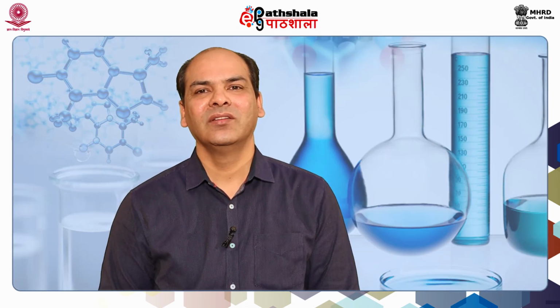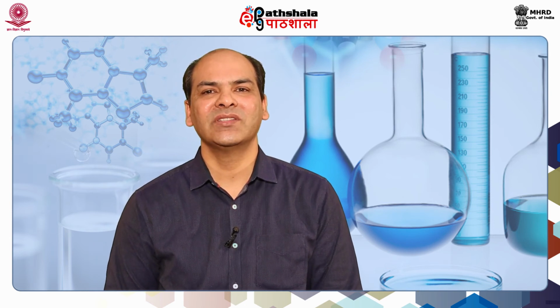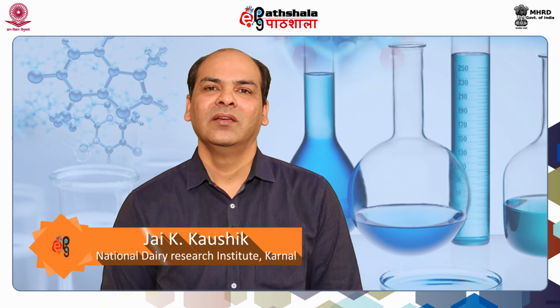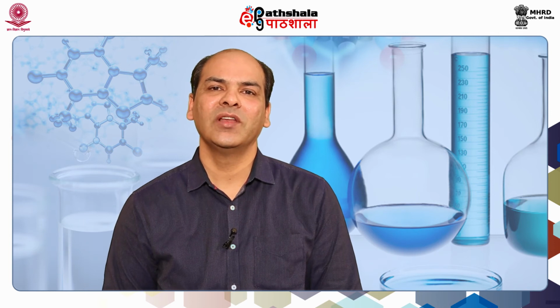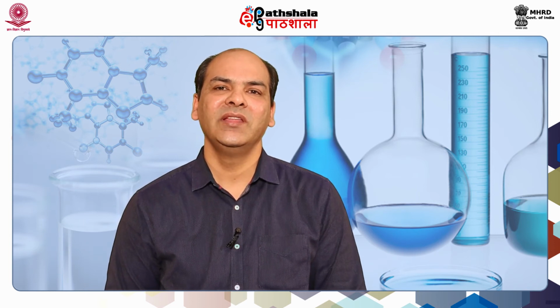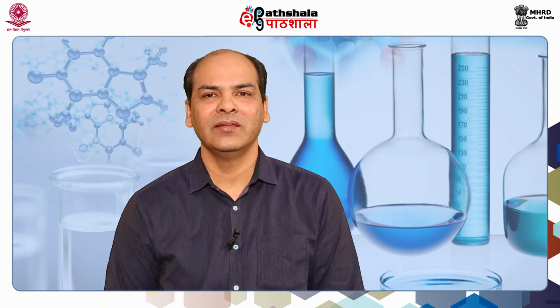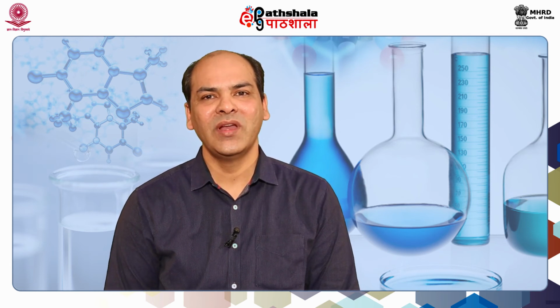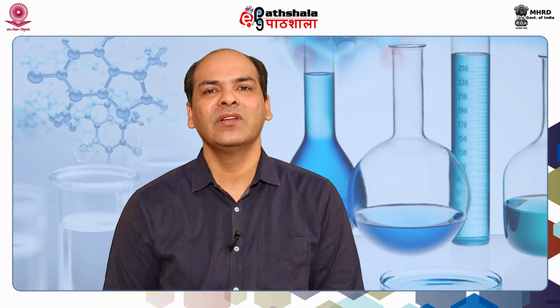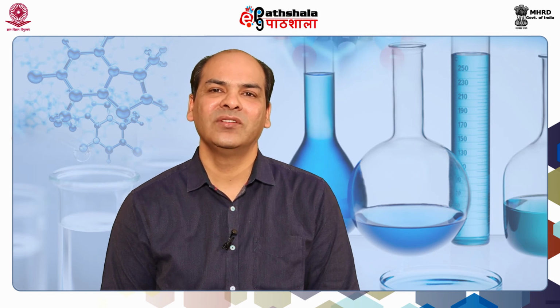In the previous slides, I introduced you to the concept of circular dichroism and optical rotatory dispersion, like how when light rotating in opposite directions, left-handed or right-handed circularly polarized lights, enter into the medium, they produce the phenomena of circular dichroism or ORD. Basically, it is the differential absorbance of one component or slowing down of one component in the medium. When they come out, the waveform is different, the resultant of the two component lights.